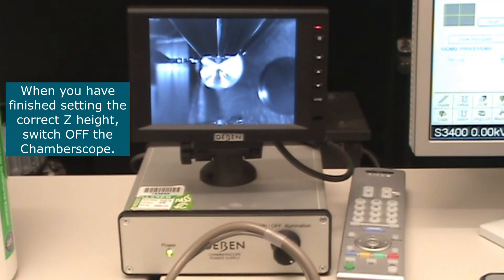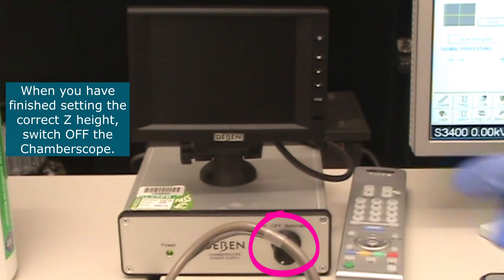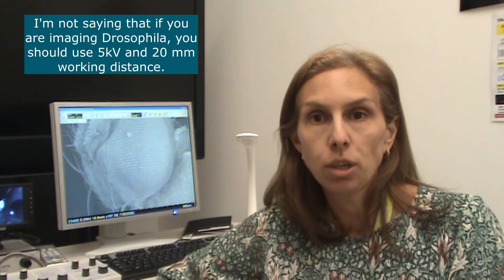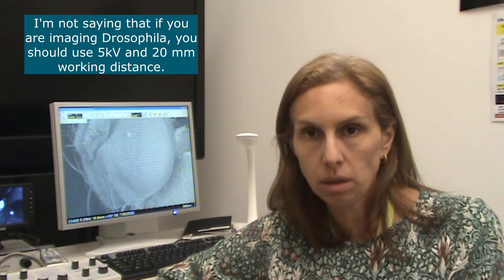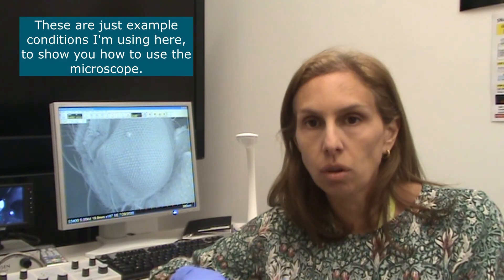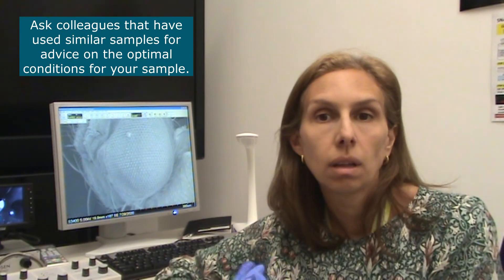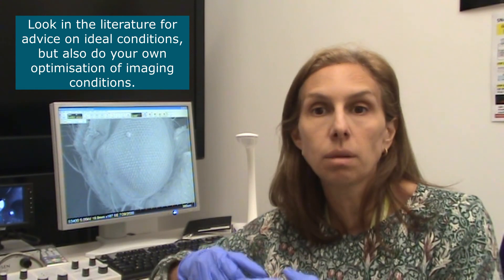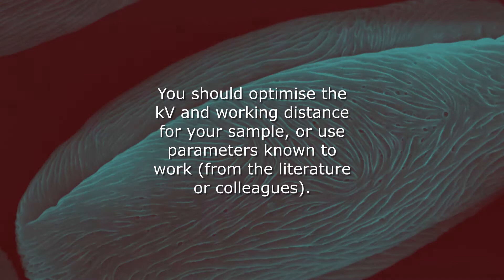When you have finished putting your sample at the right Z height, switch off the chamber scope. I'm not saying that if you are imaging Drosophila, you should image at 5 kV and 20 millimeter working distance — these are just conditions used here to show you how to use the microscope. You should ask colleagues who have used the same type of sample what conditions they use, look in the literature, and do some optimization yourself on the microscope.